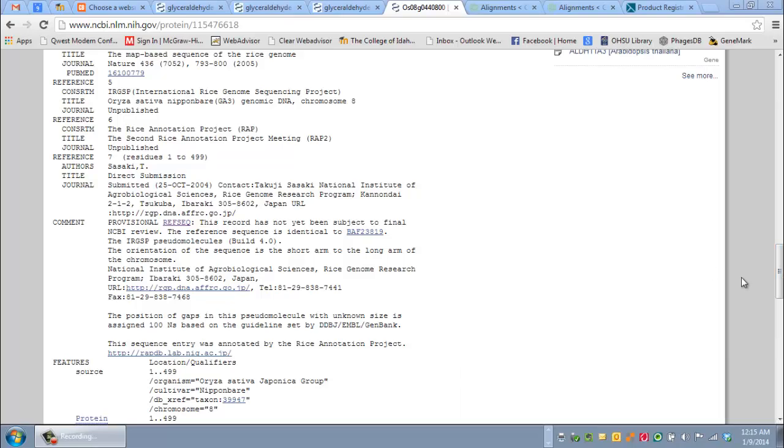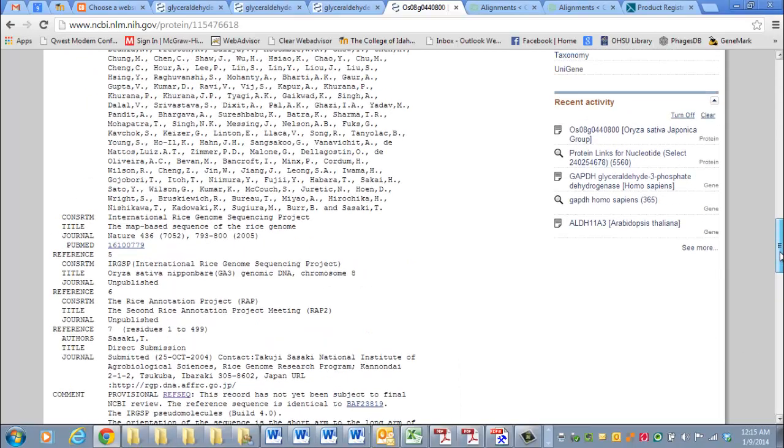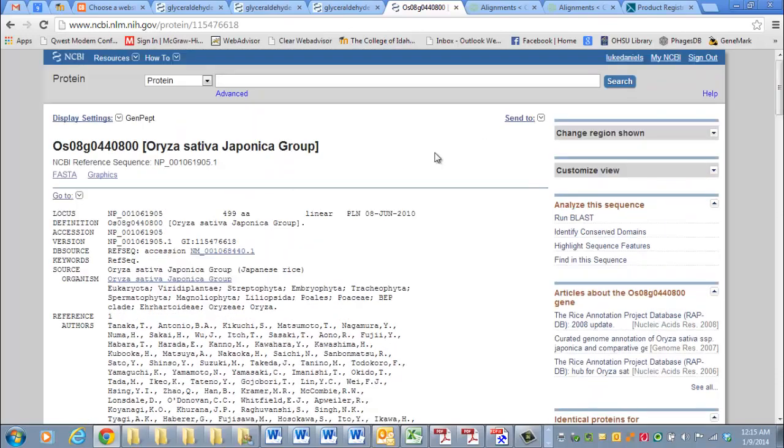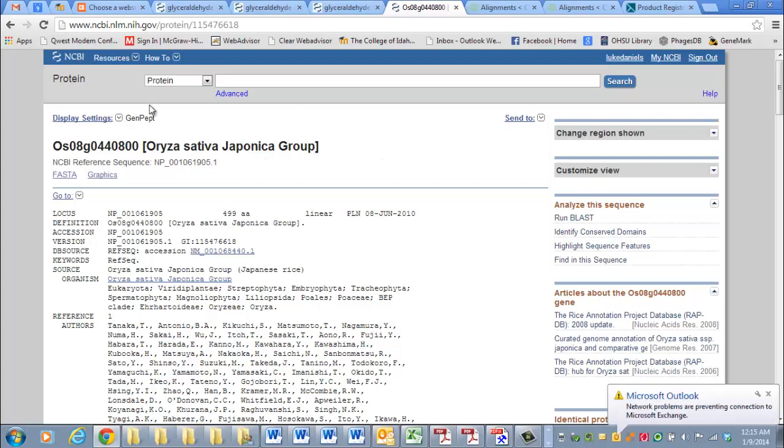Okay, this is a test. I wanted to see if this would be helpful in showing you guys how to do a protein alignment. So far we've done DNA alignments.